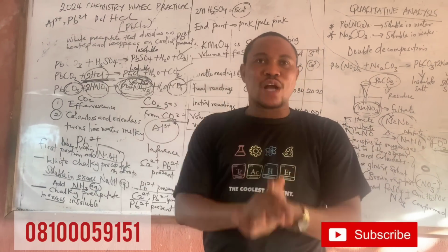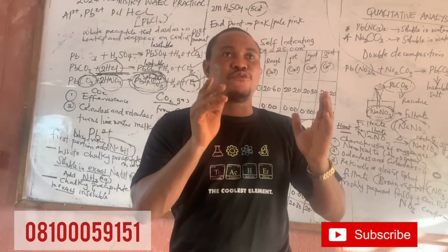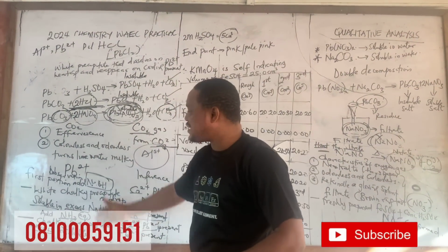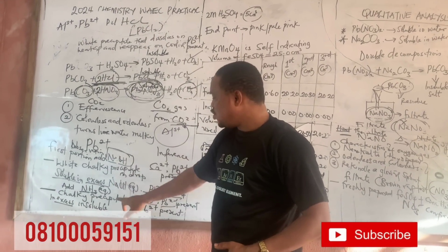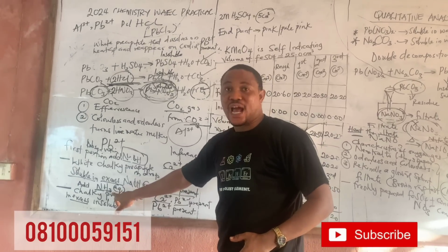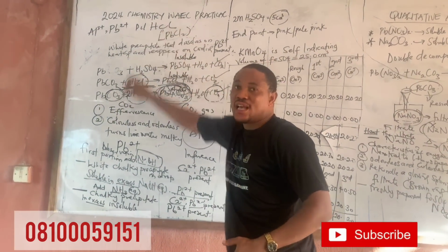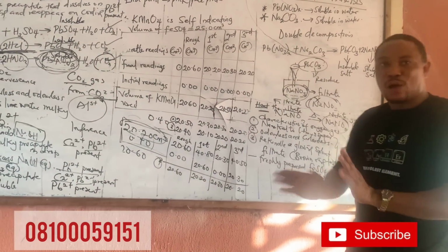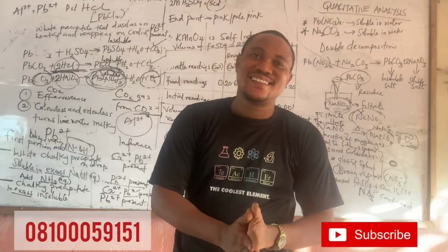Note this, watch this video over and over again. Very important. And I've told you, for the reagents you are going to buy, for the tests that I use, you are going to be needing sodium hydroxide, you are going to be needing ammonia, right? And you are going to be needing HCl. And you might be needing H2SO4. You might be needing Fe. So these are the ones you prepare. Not that you just go and buy all the reagents, you waste your money.